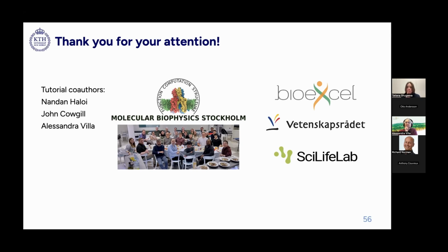And another thing, I haven't worked with DNA protein complexes myself, but I remember that there might be some issues with different attractive forces from DNA residues and protein residues.